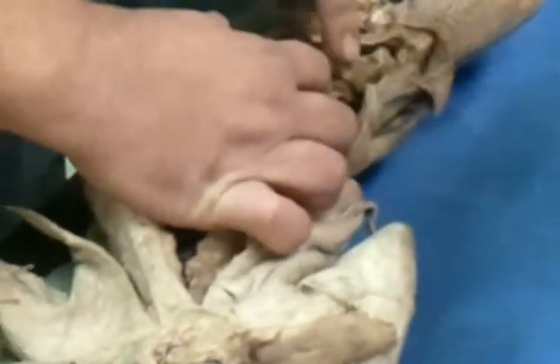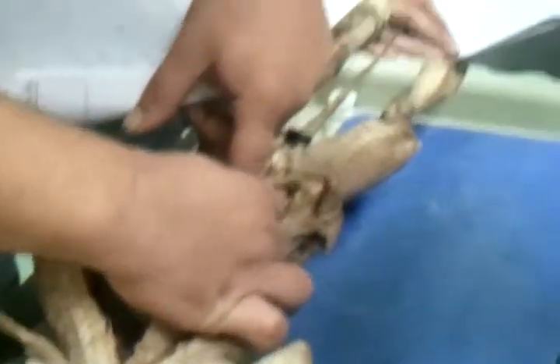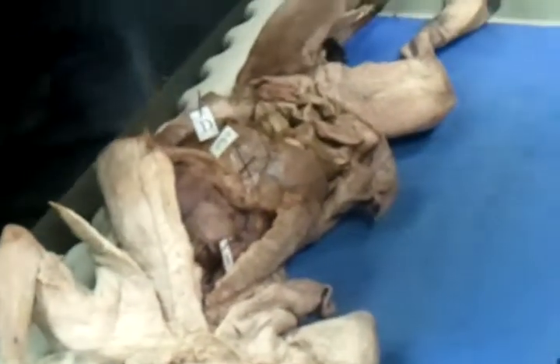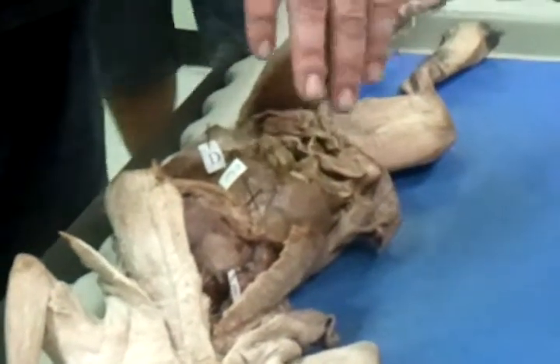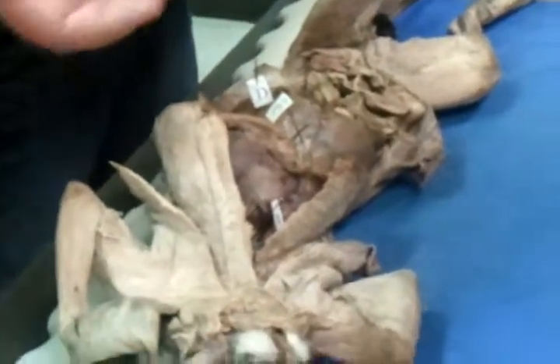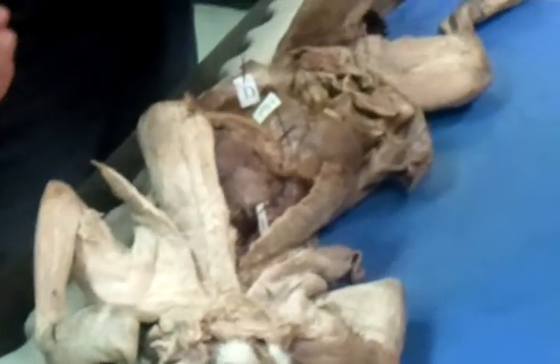So with these other lobes, the left lateral sits almost underneath. It's not as pronounced as this one, obviously. And the right lateral, I'm sorry, did I say left? And then this one underneath would be the caudate. Okay. So in all actuality, do you think I'm really going to be able to get to the right lateral and caudate so you guys can see it? Yeah, I don't think so either.